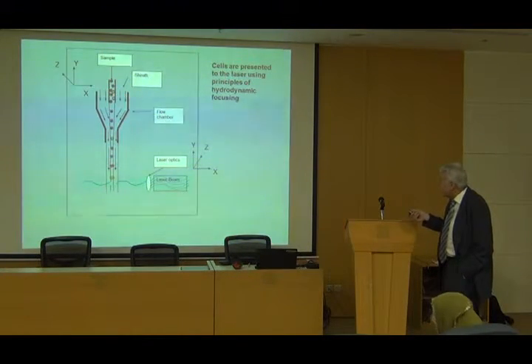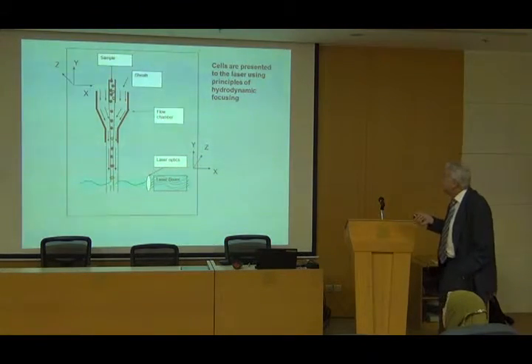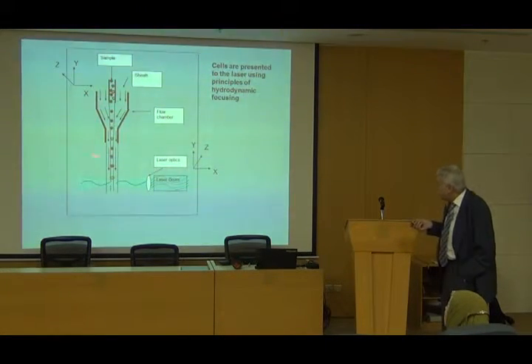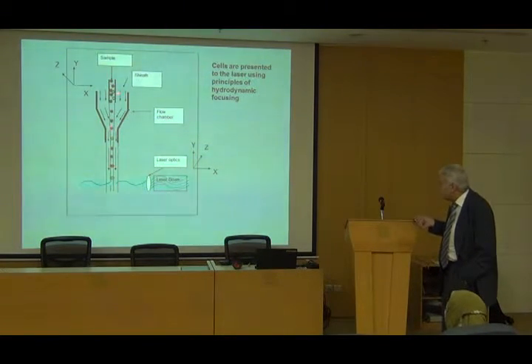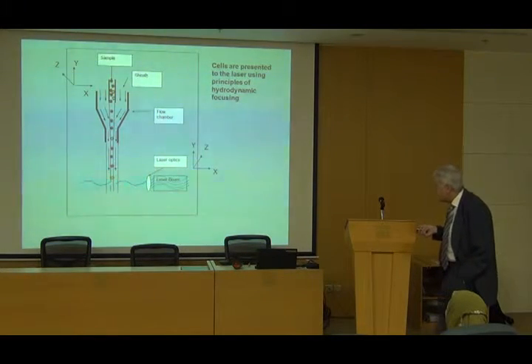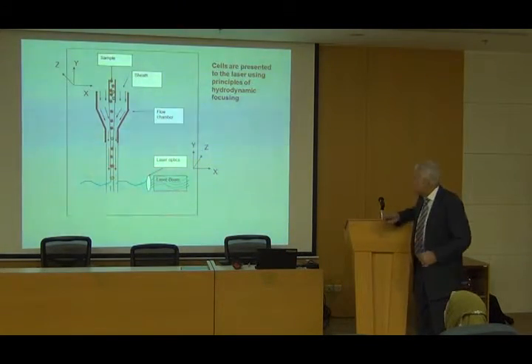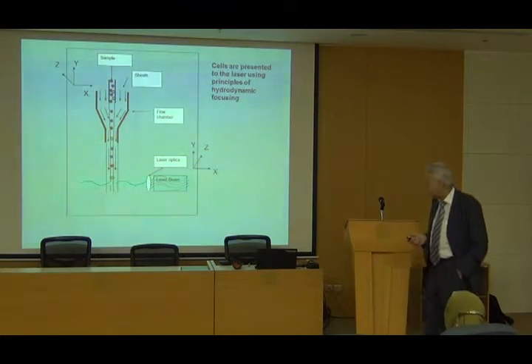On the outside there is a sheath fluid, which is PBS, and in the middle is running your cell population. At this point, one cell after another goes directly to the laser beams, and each cell is detected one by one. This is the principle of hydrodynamic focusing.